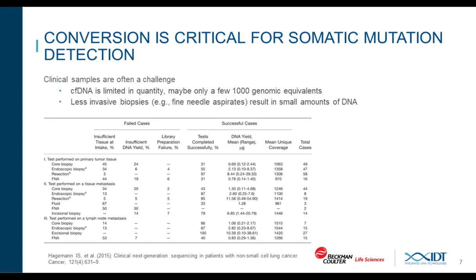If the tissue heterogeneity does not have the variant you want, going back to the patient can be painful. Cell-free DNA through liquid biopsies is less painful, and if you can increase conversion, you can increase your success rate. So Shilpa here will discuss how to address the conversion challenge.